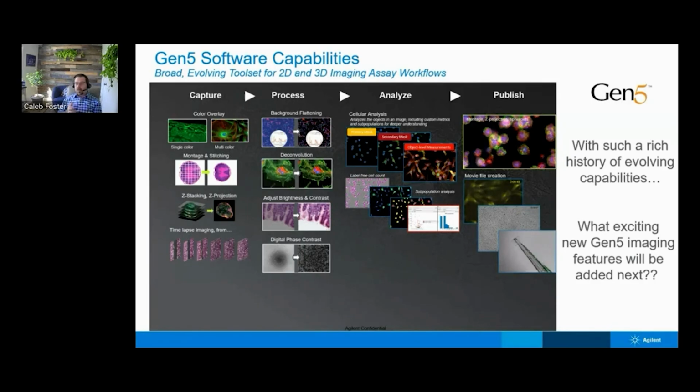And if you look at the numerical aperture of that and you calculate the resolution in like a blue channel or a green channel, you're down to 300 to 400 nanometer resolution per pixel. So you're able to resolve down to bacterial, but it is not a super resolution system. But the confocal would be the one that gets you the best resolution. You can get good resolution, submicron resolution in wide field as well, but there can be a little more haziness because it doesn't get rid of the out of focus light if it's a more three-dimensional sample. Brilliant, thank you very much.